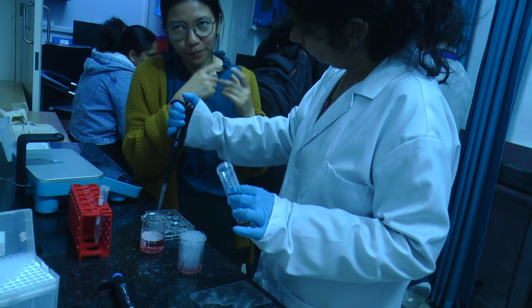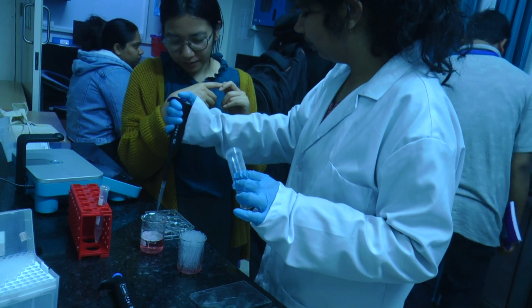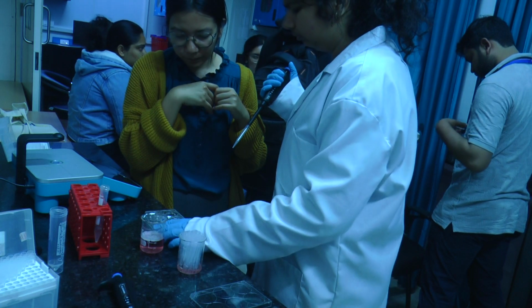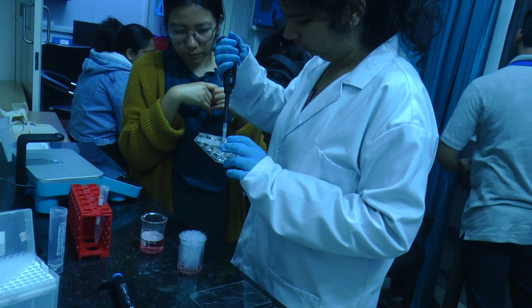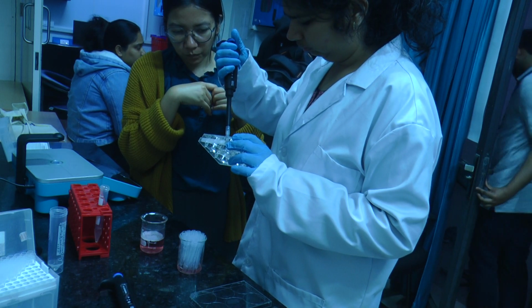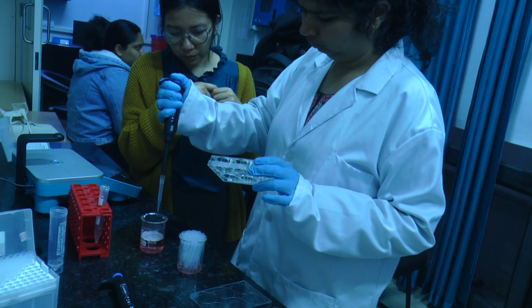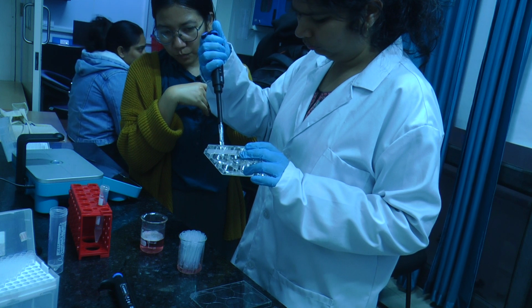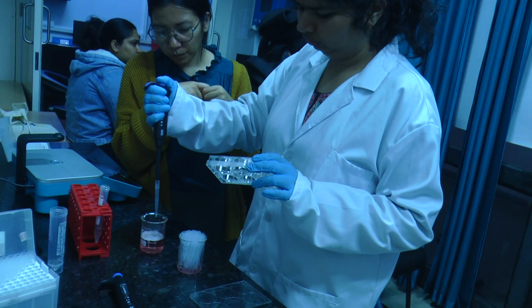No, this is only one part of it. I will tell you. See, GPMVs, I have just started working on, like 3 months. Last year I started, so in total I have worked only 3-4 months on that. What I have done right now is extract them and then do shape analysis with them. I have given them the buffer which I showed you.